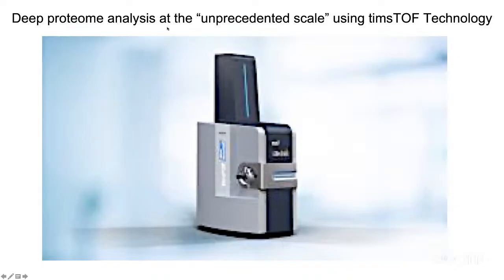Typically in proteomics, our goal has been to first get as many proteins as possible from a given sample. Using different workflows from DDA to DIA, what we have been trying to achieve was around 5,000 proteins from a typical cell line sample. But now with this new technology, we have reached almost 8,000-plus proteins very easily, and the group analysis is even crossing 10,000-plus proteins. So this is a wonderful, incremental change that we could observe using the 4D omics technology of the timsTOF. So I request Dr. Argya now to show the timsTOF instrument and explain about it.